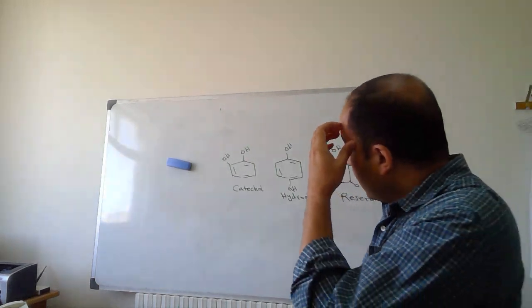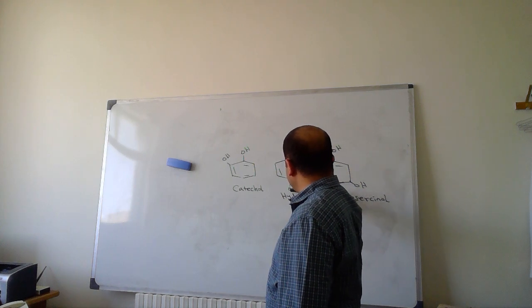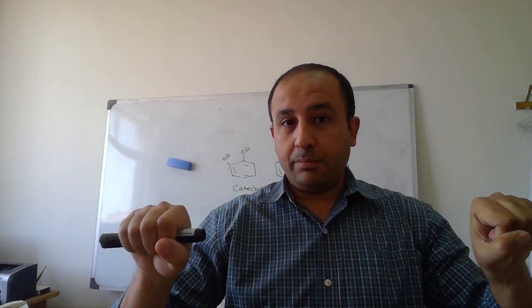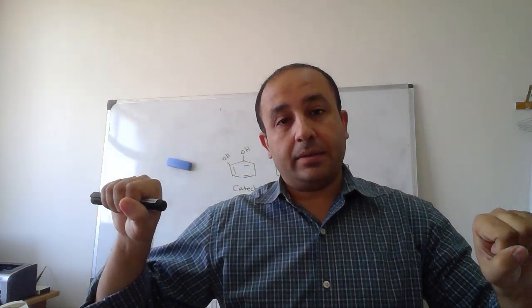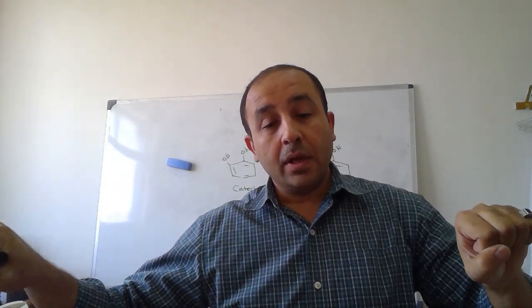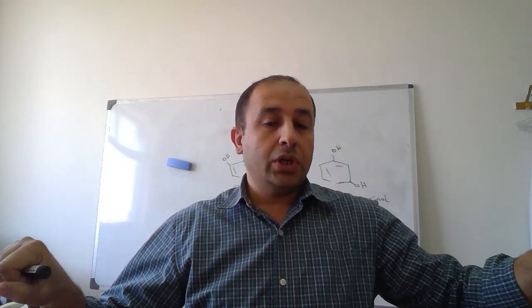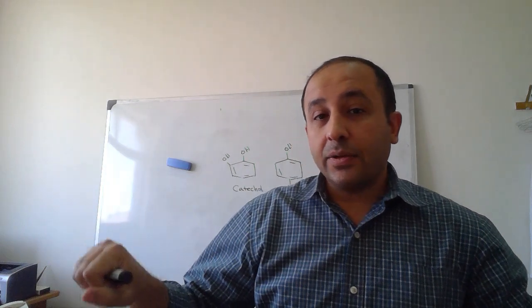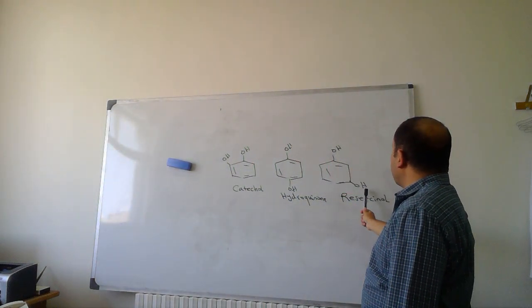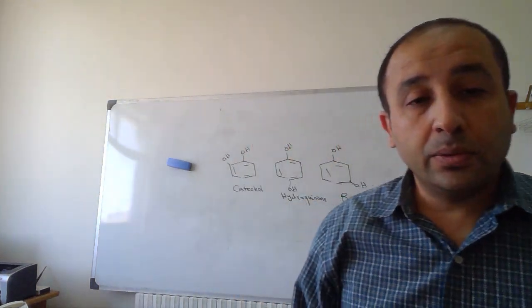Now, para-hydroxyphenol, which is hydroquinone, can make good bonds because we can anchor it from the right-handed functionality and the left-handed functionality. So it can use both of the functionalities. Now the resorcinol, which is meta-hydroxy, can still do hydrogen bonding.